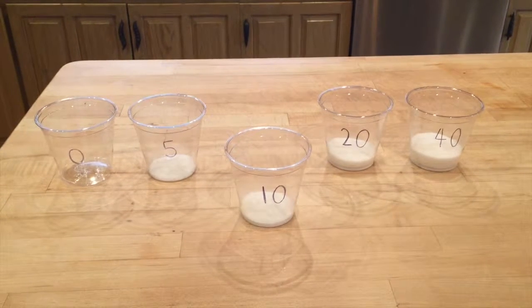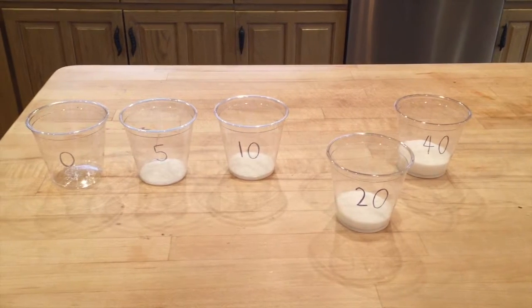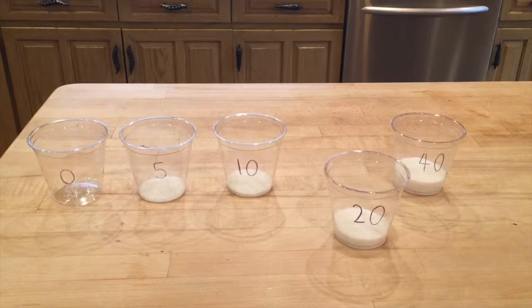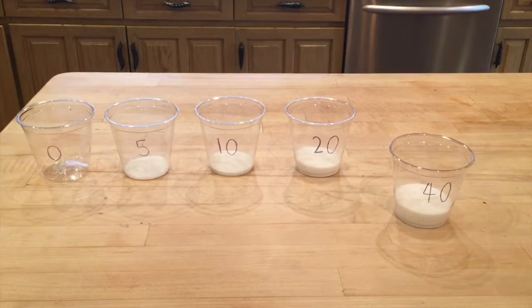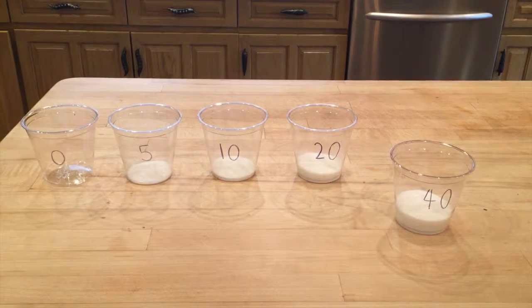In trial 3, 10 grams of salt was added to 100 milliliters of water. In trial 4, 20 grams of salt were added to 100 milliliters of water. In trial 5, 40 grams of salt were added to 100 milliliters of water.